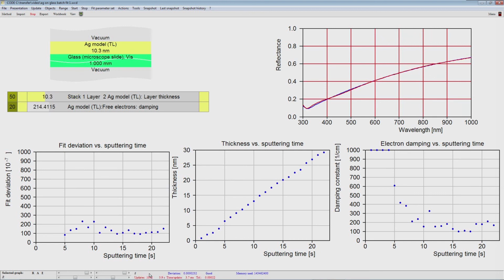Okay, let's check if we can find better values, but probably the values are not really changing anymore. We found already the best ones before, where we did a little less systematic search, but now this is a nice example for a full search in the parameter space.